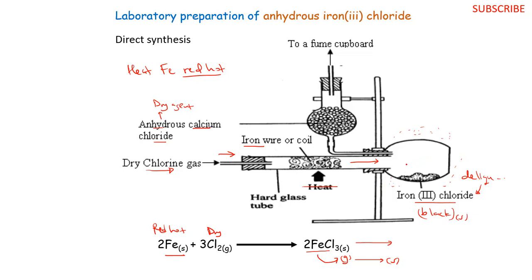Because of that, we shall ensure that we provide a drying agent so that we keep it free from water vapor. And then the excess chlorine gas being poisonous, we shall leave it to escape to the fume cupboard. Just as a precaution, here we shall have our excess chlorine gas that will escape out.